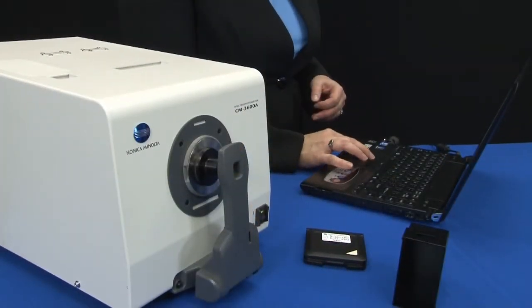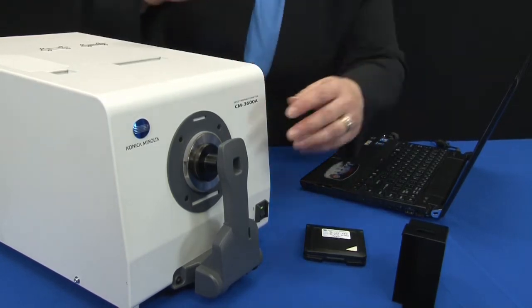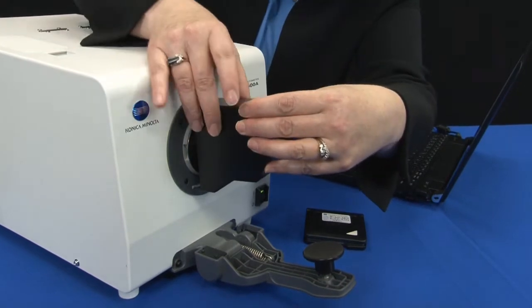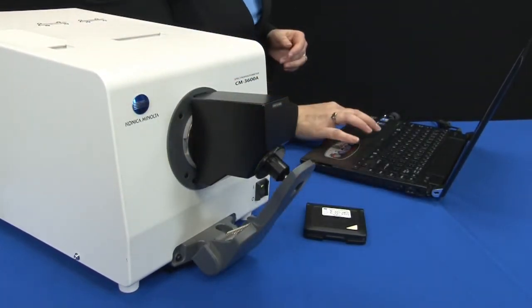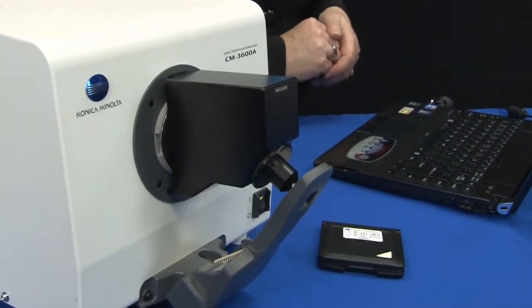The procedure for daily calibration for Konica Minolta color measurement instruments is simple and straightforward. Two measurements are taken with the instrument. The black measurement, referred to as a zero calibration, can be performed by utilizing a special attachment for the instrument which absorbs all light. This is referred to as a zero calibration box.